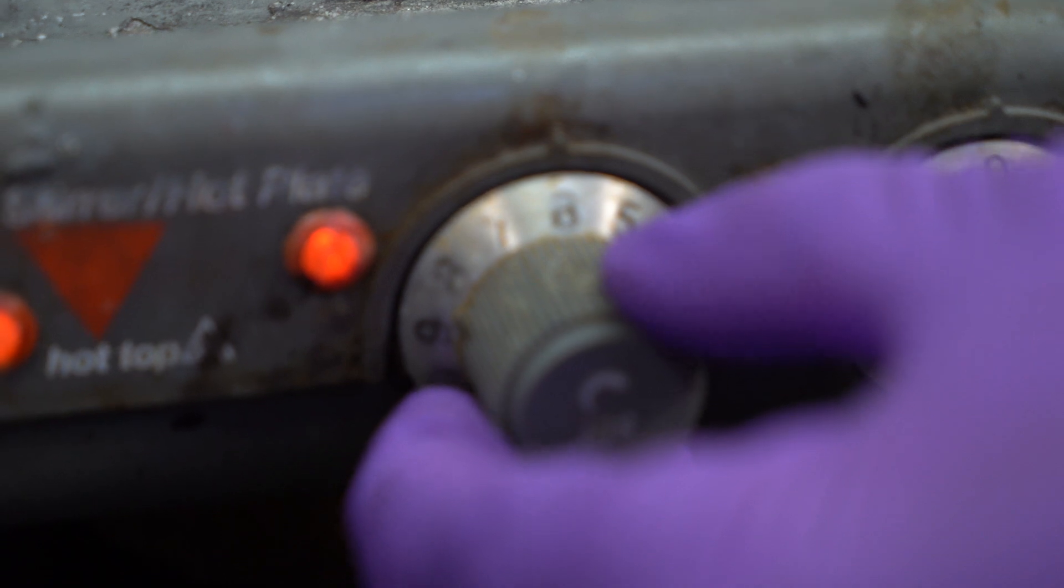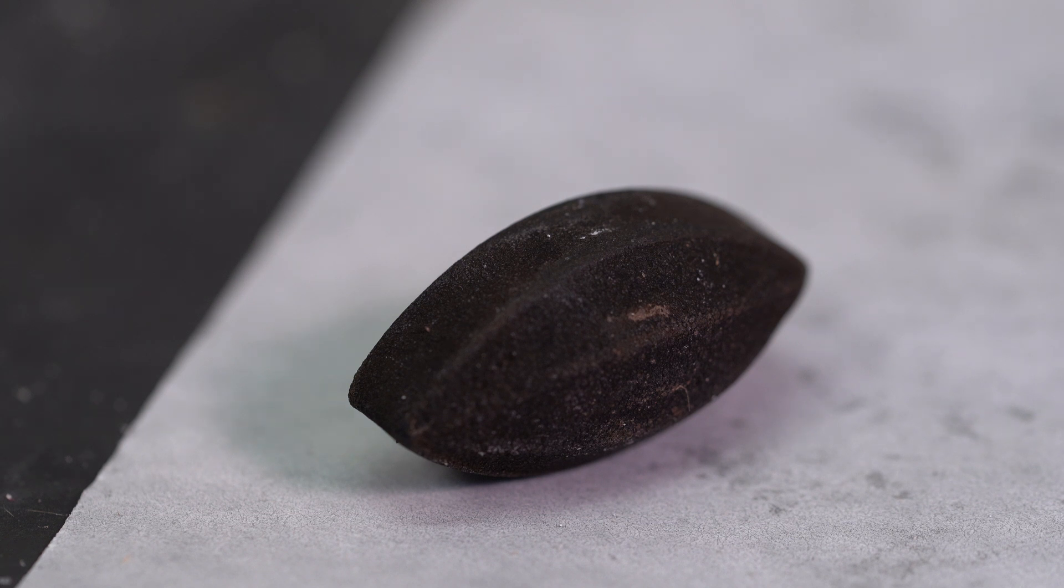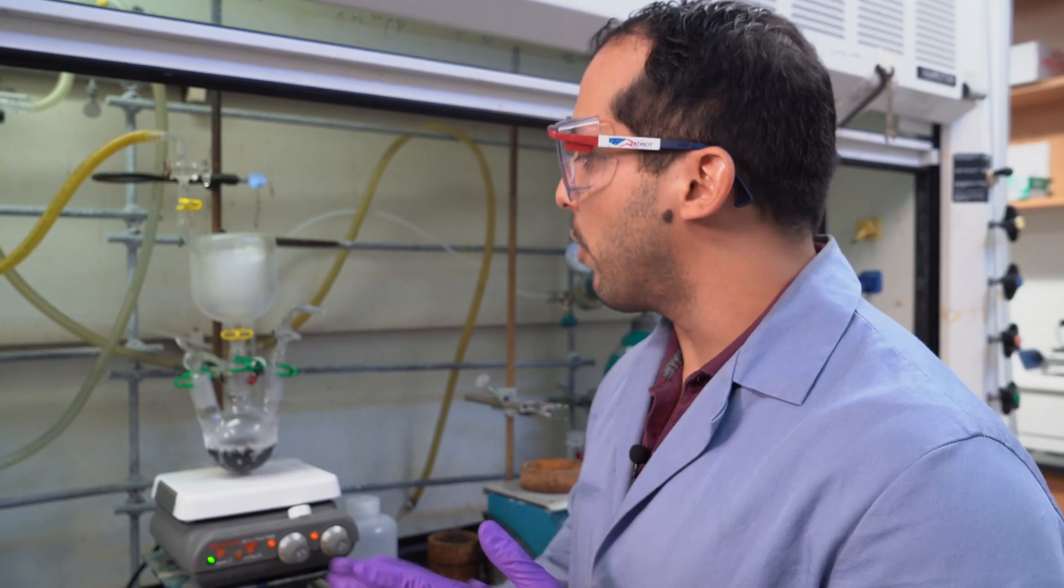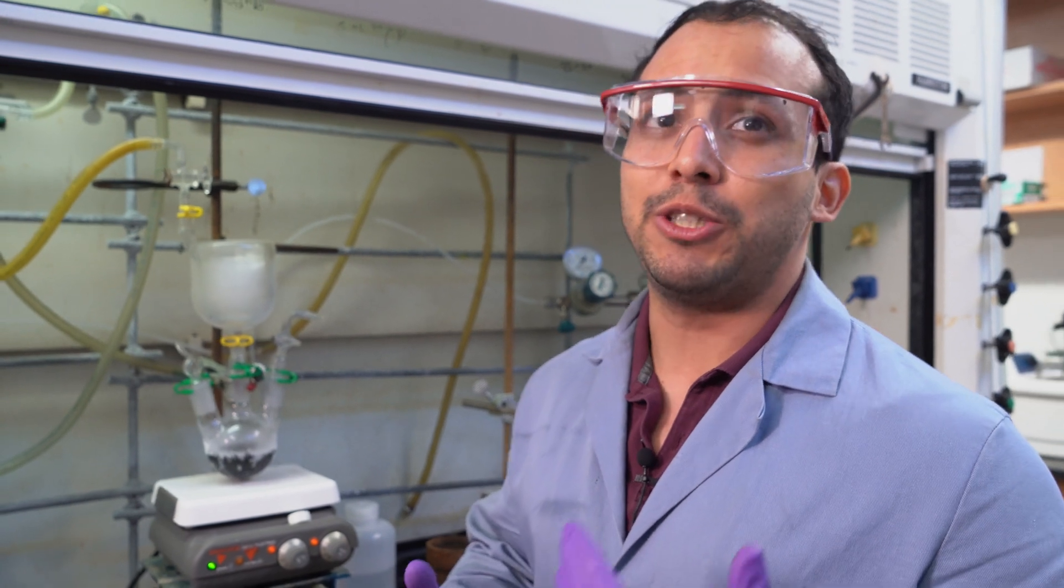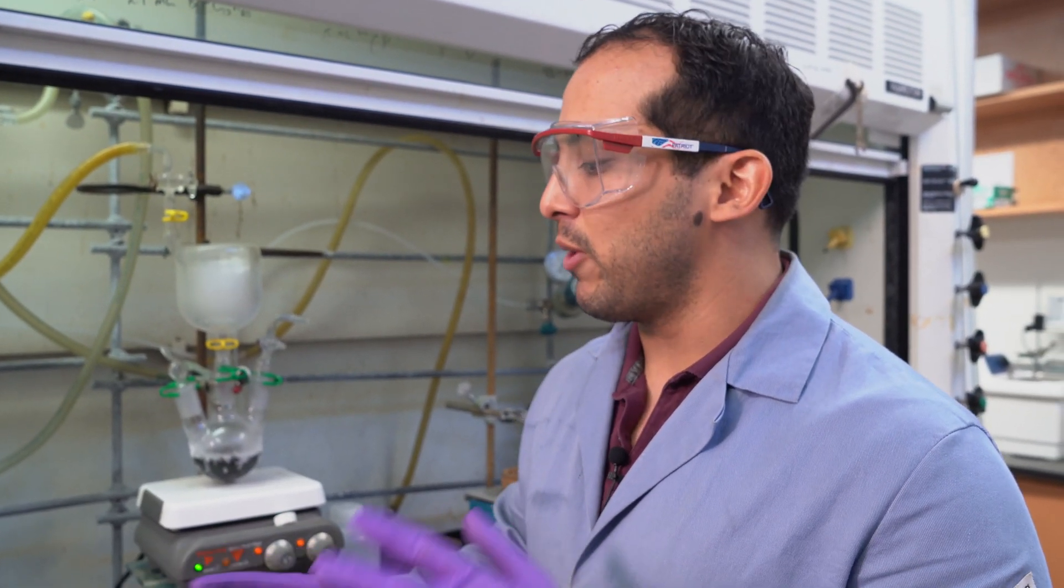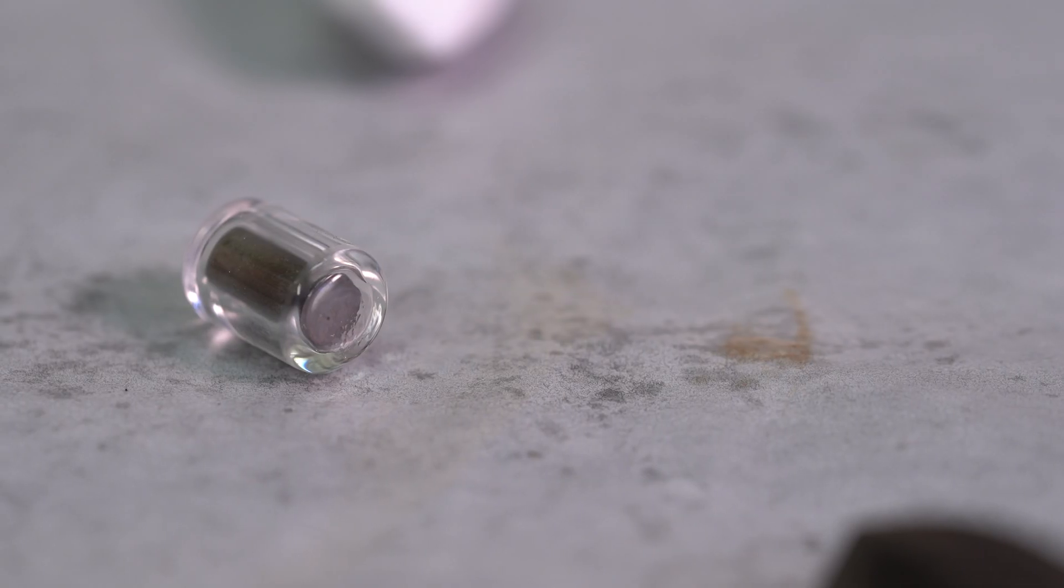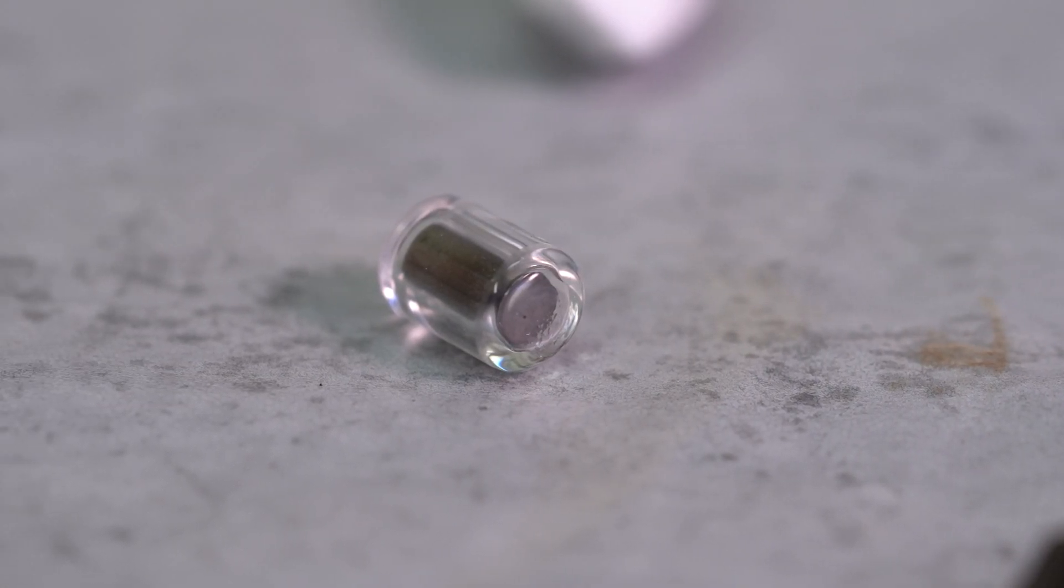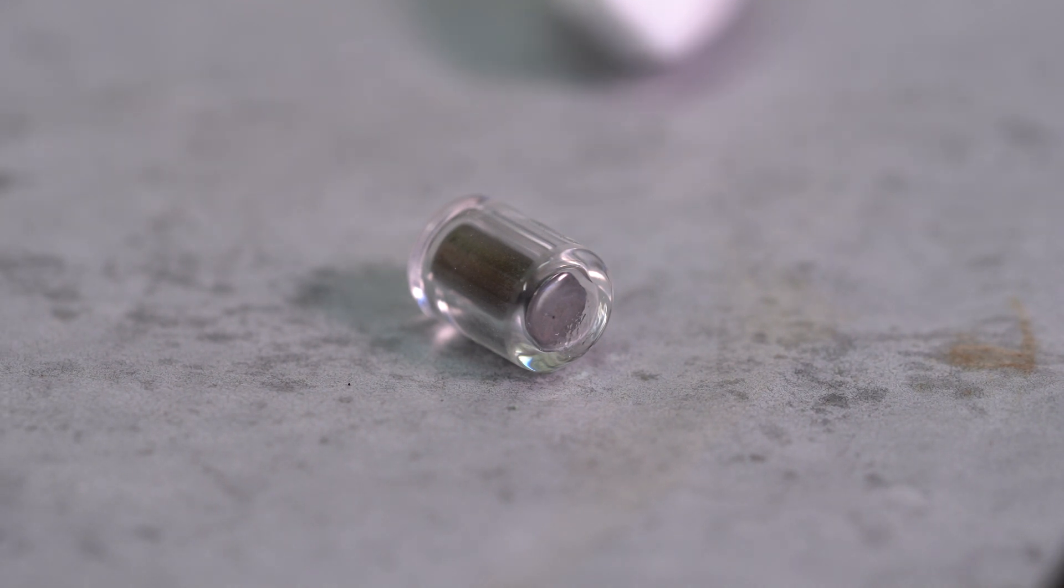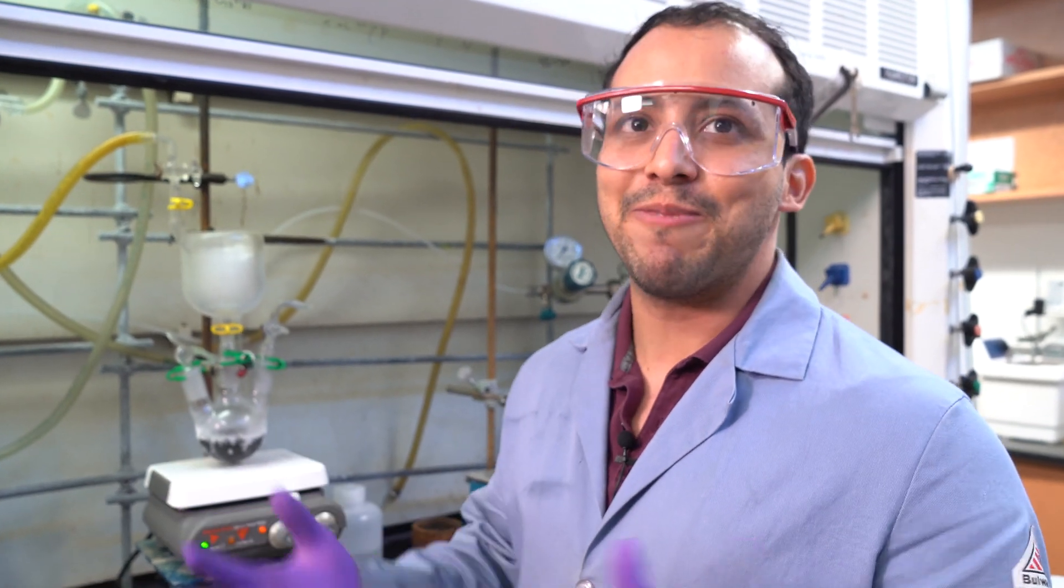At the beginning this was kind of normal for me because I used to do this with carbon nanotubes that are black, so I thought that carbon nanotubes were depositing on the Teflon stir bar. But when I tried with boron nitride, which is white, I would still find the same. That's when things started to look odd, and that's why we switched to a glass stir bar that doesn't cause side reactions. Everything's starting to work fine, reproducible results, and everyone's happy now.